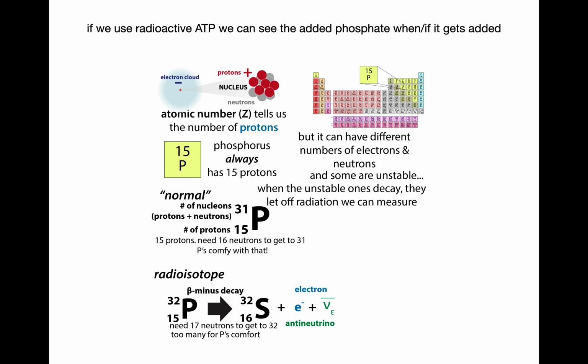And in a radioactive isotope, what you have is a version of an atom that has an imbalance of neutrons and protons, so it's kind of uncomfortable, and then it rearranges that nucleus, that core where the protons and the neutrons hang out, and then it lets off some energy and particles as radiation that we can then detect, that released high energy radiation.